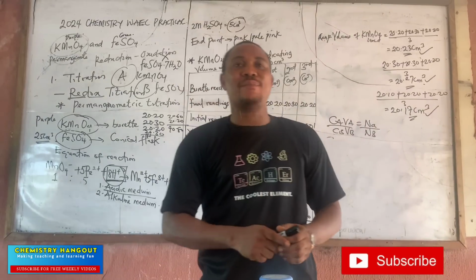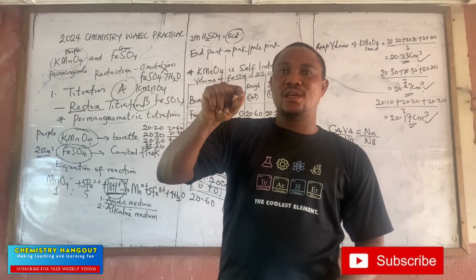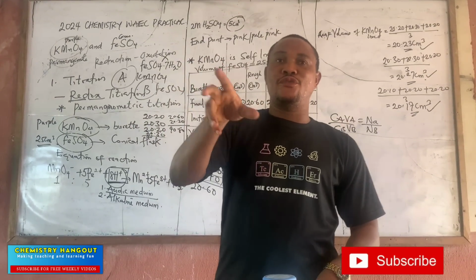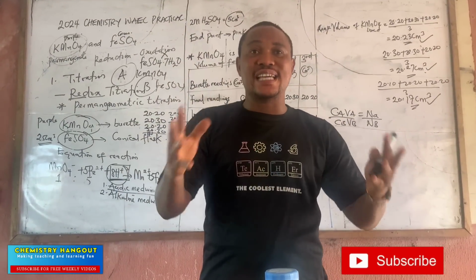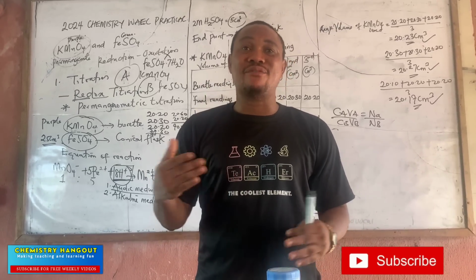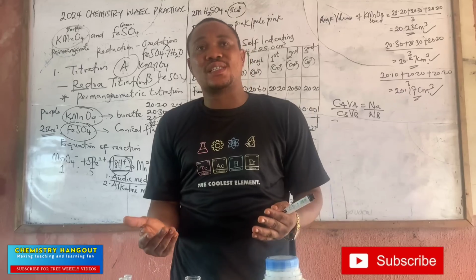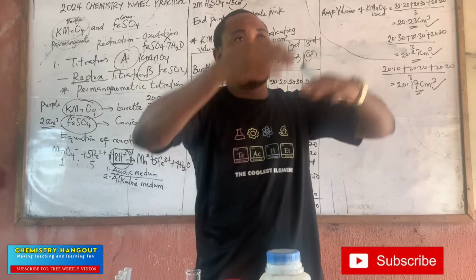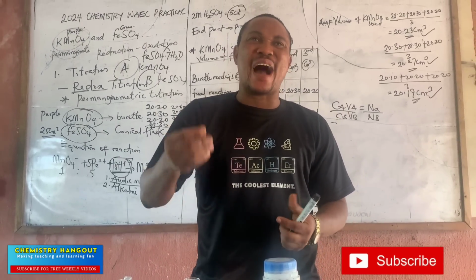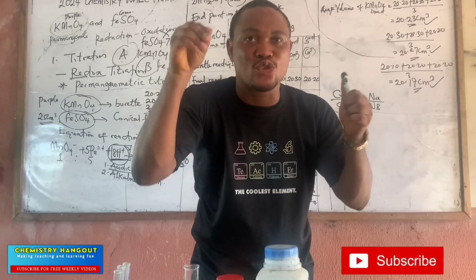Very important, let me answer this question. In the confidential report, the instruction to schools that they gave us, you will see a lot of reagents there. These are customary, meaning that's how they bring it every year. Some people have been asking me, sir, I am a new chemistry teacher, does it mean that I'm going to buy all this? No, you're not. You are only going to buy the ones you know are significant to the practical we want to do.